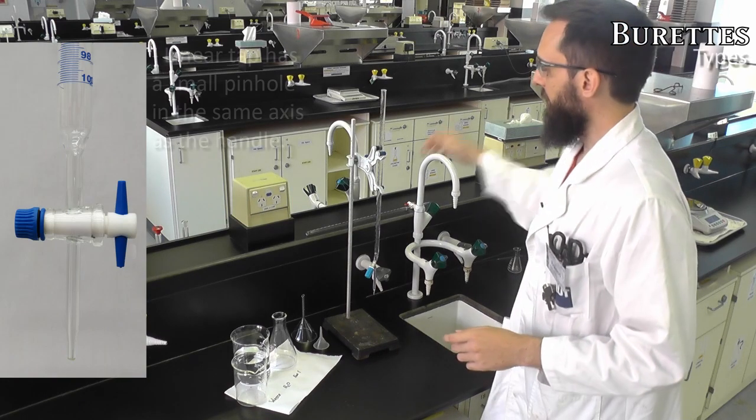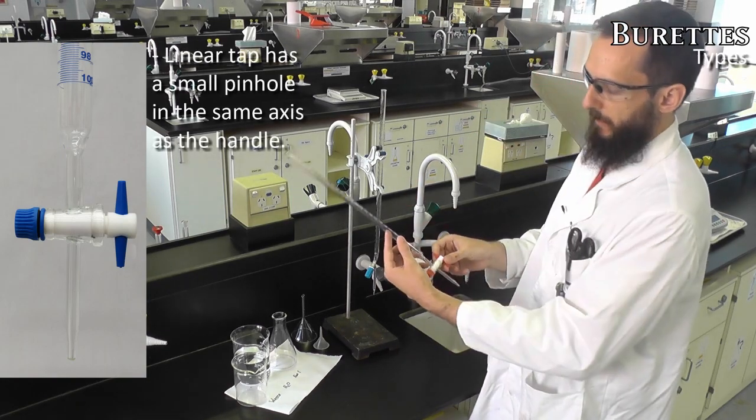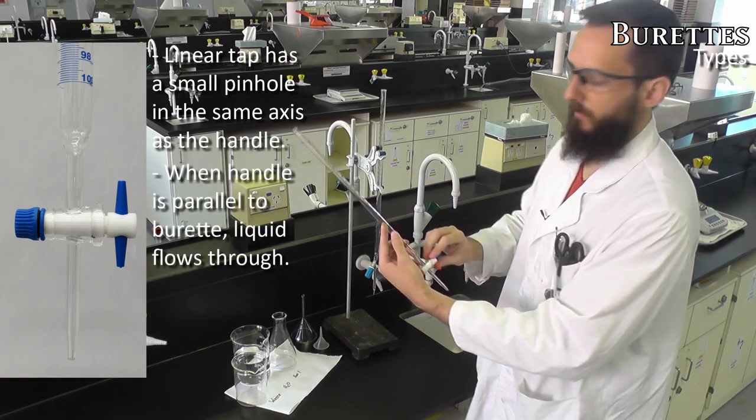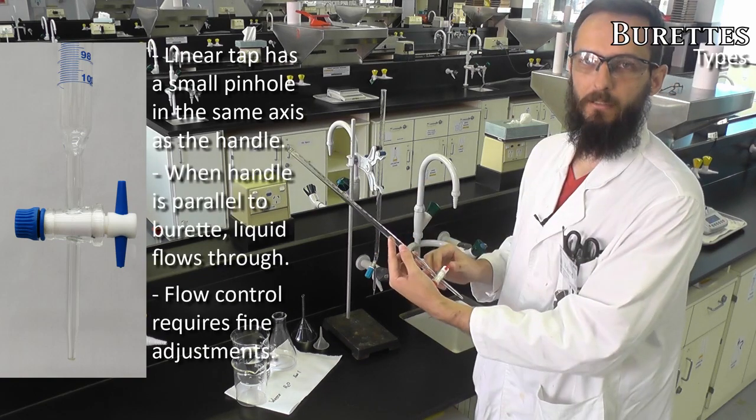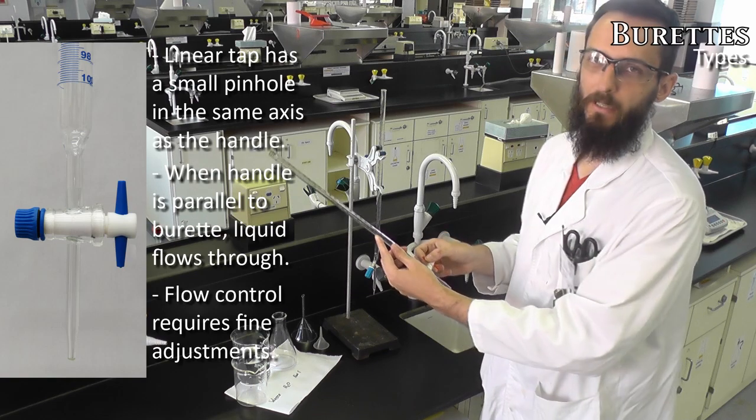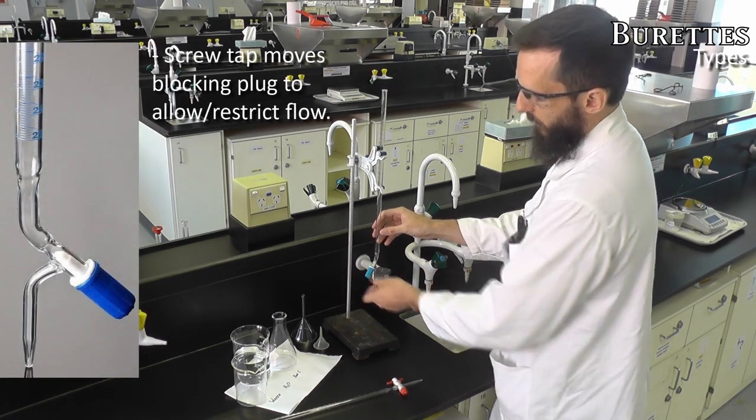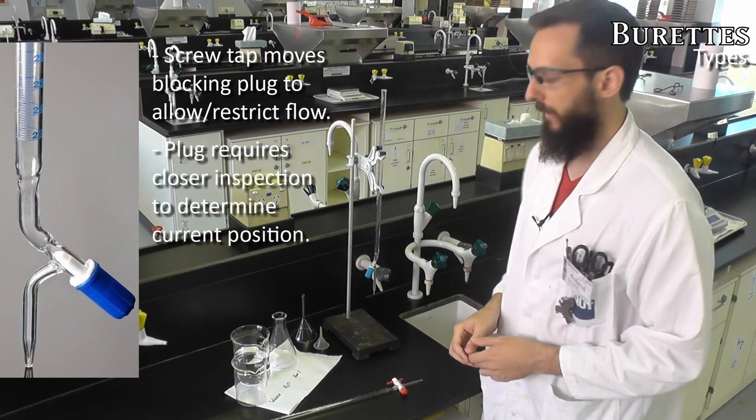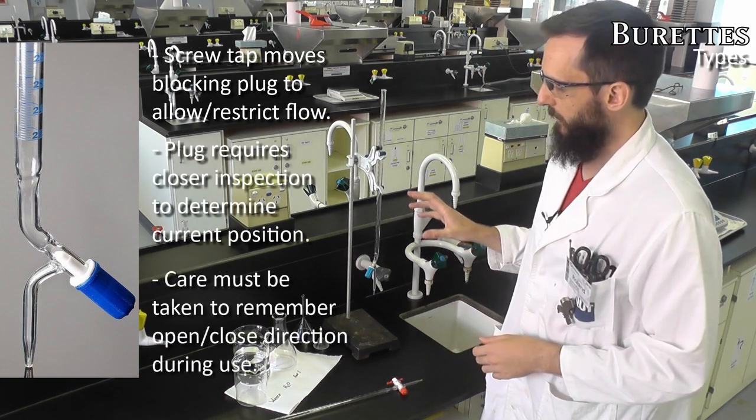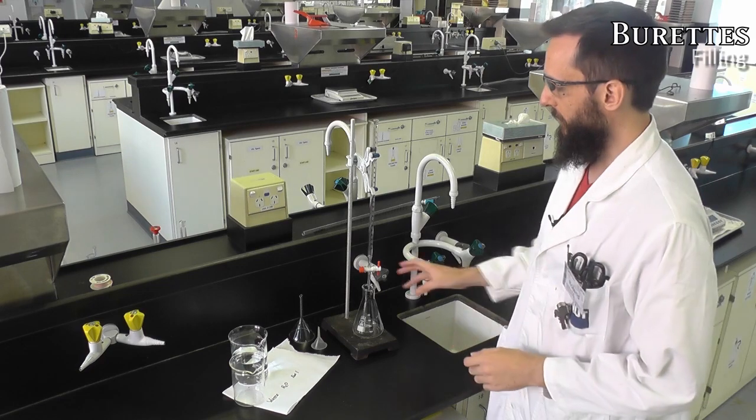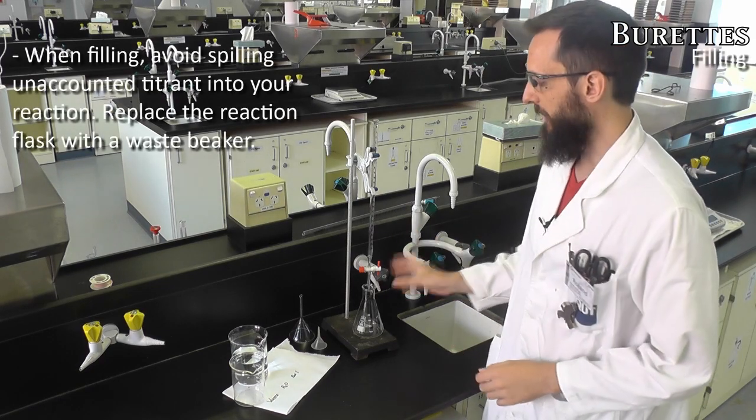We have two types of burettes that we use here commonly in the lab. The first has this tap handle that when in parallel with the burette lets the liquid flow through, and when perpendicular stops the liquid, in between adjust the flow rate. The second type is a simple screw tap where loosening it increases the flow rate. It's important to realize that when you have the screw tap it's difficult to see from a glance which position you're in.